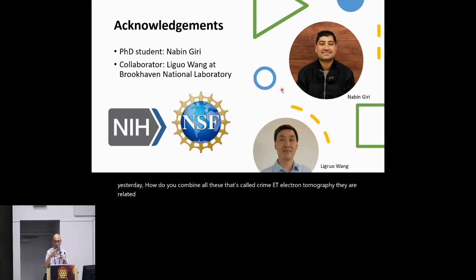How do you combine and integrate all this data to build the live dynamics of entire cells, including the molecular machines, proteins, and large organelles? Yeah, that's an open challenge right now. We're trying to move in that direction. We're currently creating large molecular machines, but my collaborators always encourage me, hey, you need to work on Cryo-ET. You need to transfer technology from the computational world, AI, AlphaFold, all those technologies, to build that entire cell structure. That will be the next breakthrough.